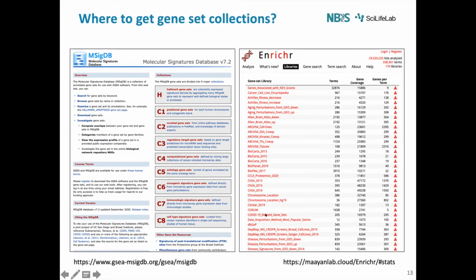There are many other databases that you can look at. So here I'm just referring to the tip of the iceberg: gene ontology, KEGG, Hallmark pathways, Reactome. Those are what usually come to my mind when I think about databases, but there are many, many more that you can try in your data set. If you're looking at transcription factors, there are different ways to interpret that as well, but that really depends on your specific project.